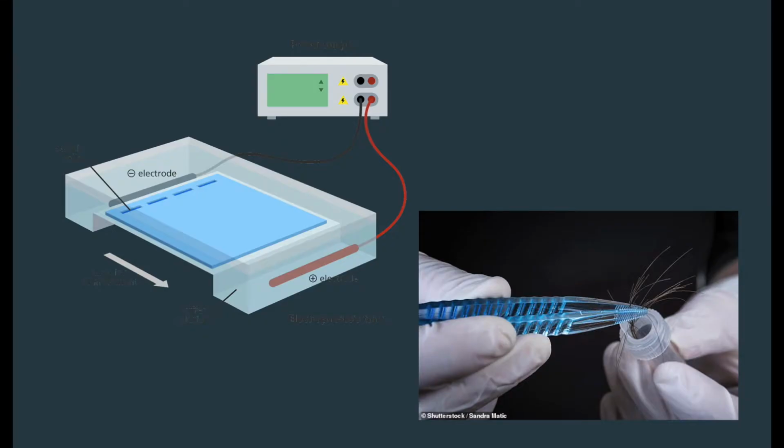VNTR DNA fingerprinting is used to differentiate between DNA samples. A variable number tandem repeat, or VNTR, refers to the location in a genome where a short nucleotide sequence is organized as a tandem repeat. These can be found on many chromosomes and often show variations in length, number of repeats, among individuals. Smaller fragments are able to travel further down in the gel compared to larger ones. In this case, it is used to compare DNA samples from a crime scene to DNA taken from human suspects.